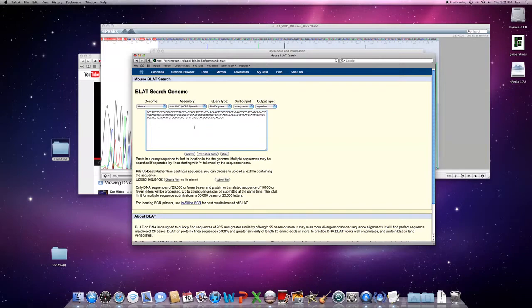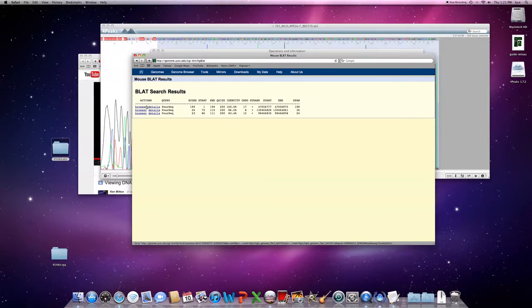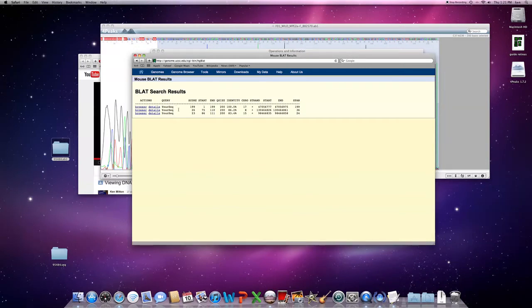And we're going to basically match this to the genome, hopefully. So we'll submit it. And it's processed very quickly. And you can see here we have 100% match with 199 spanning bases. That's probably at the top of the tail, the best BLAT match to look at.